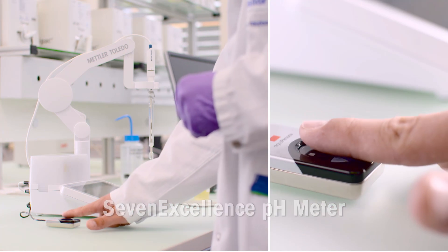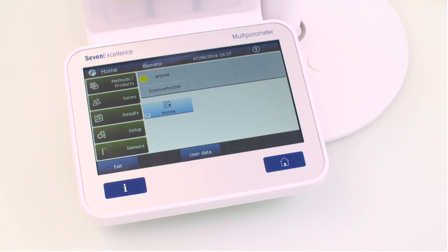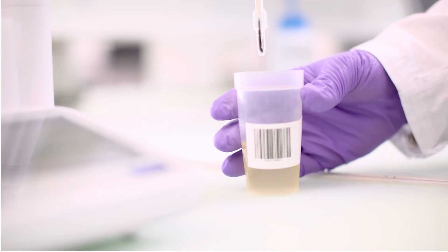The big advantage of LabX is the same easy measurement procedure for all instruments. LabX is the anchor point behind all the processes and measurements of the different instruments.